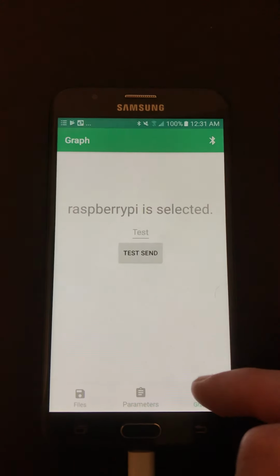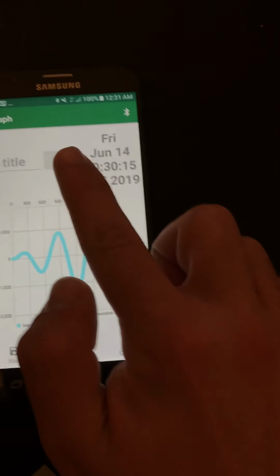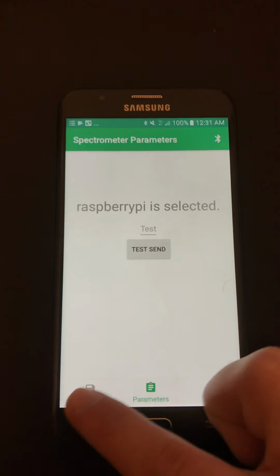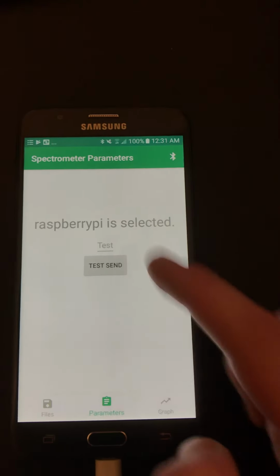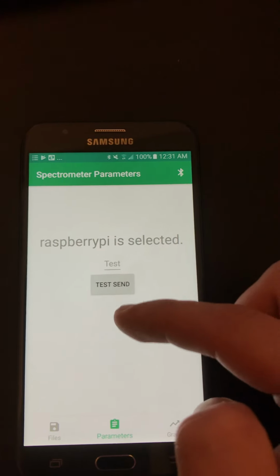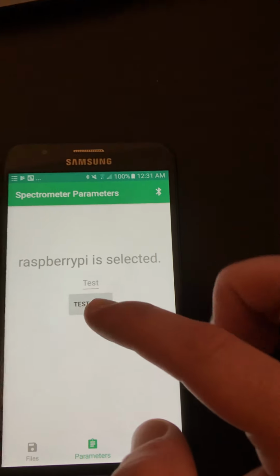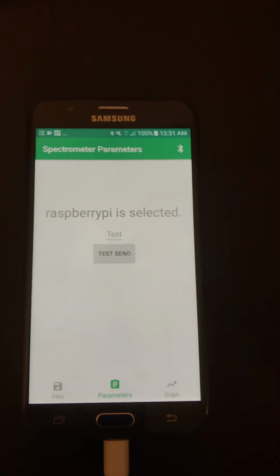There are a couple bugs right now. If you save a graph that's already saved, the app does crash. Like I said before, it takes 2 times to go onto the file screen before anything updates. This screen needs to be redone because right now it only has one setting, and that only works with the test socket server. It doesn't work with the real socket server.